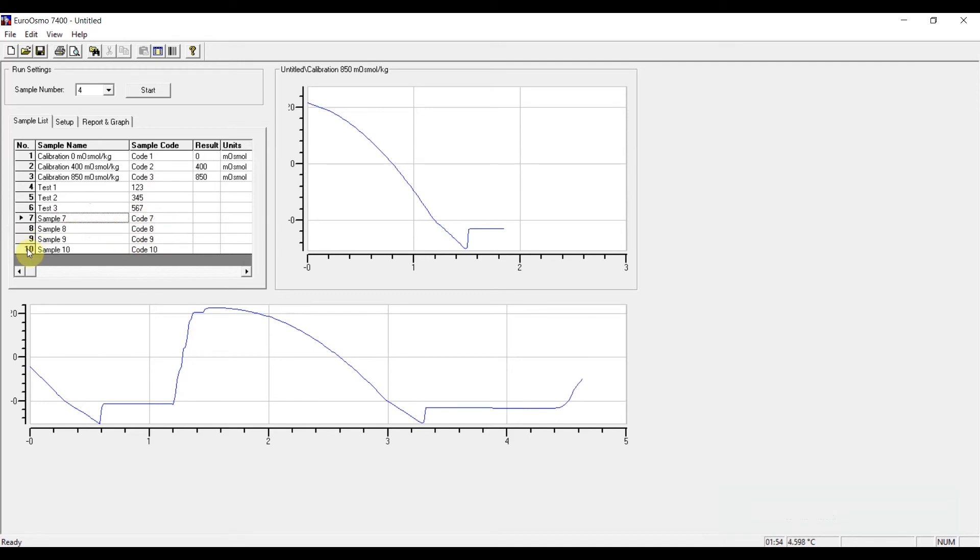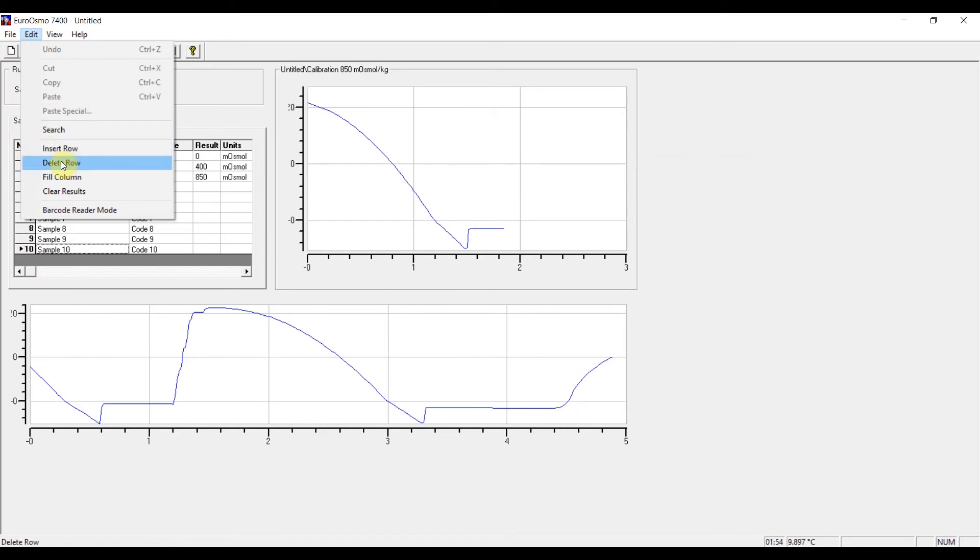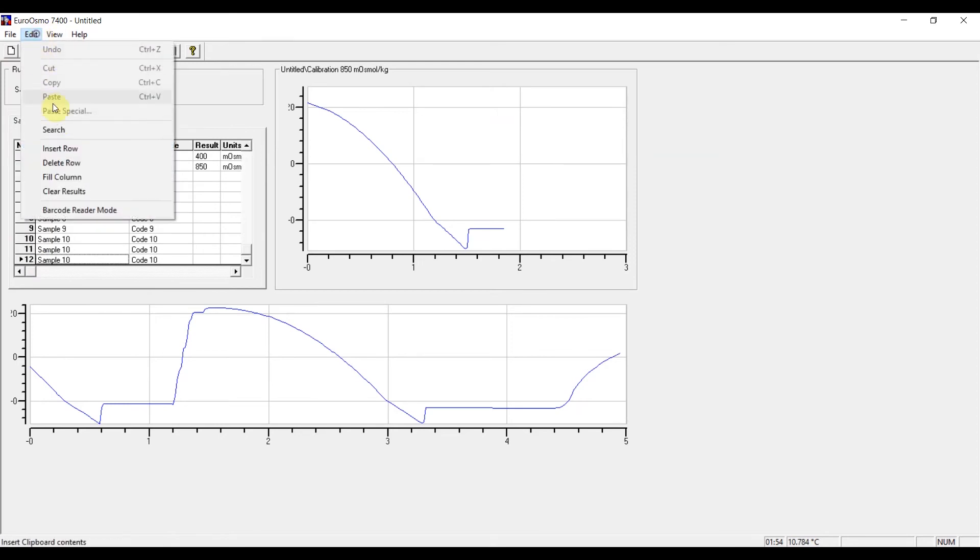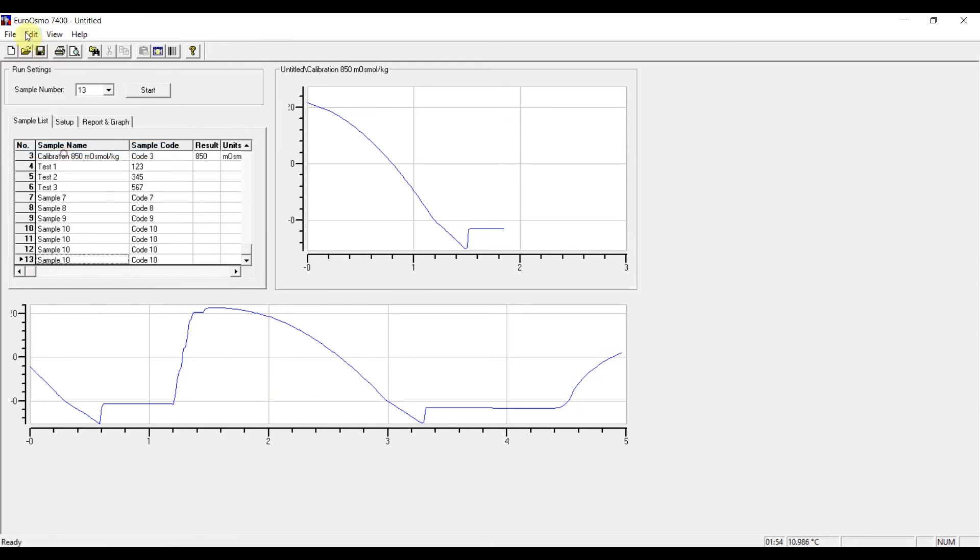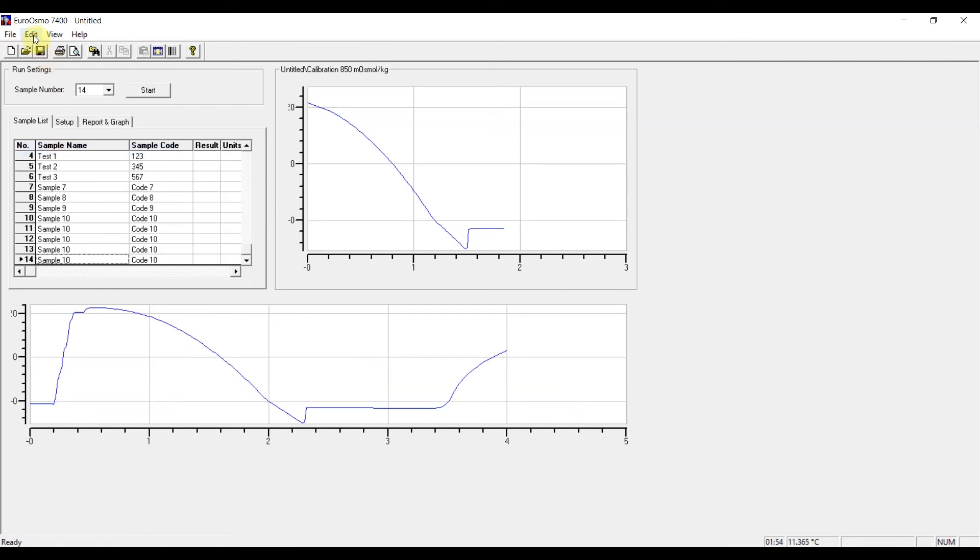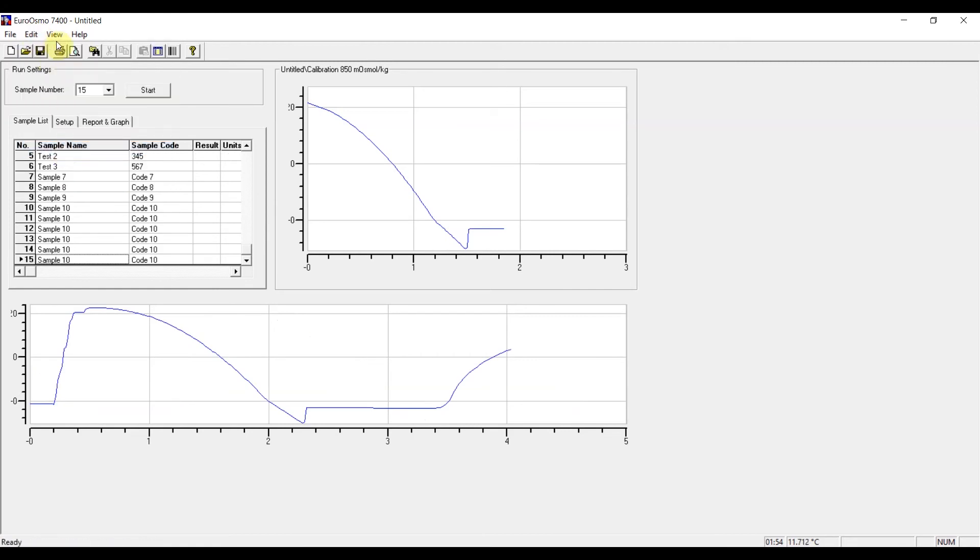Also, if you need more rows than only 10, in the edit tab you find the possibility to insert or delete rows. And here you can insert as many rows as you need.